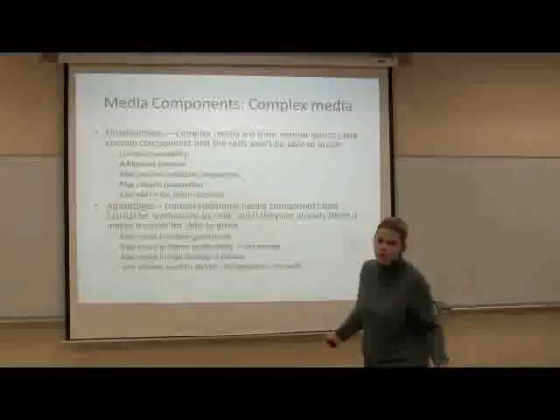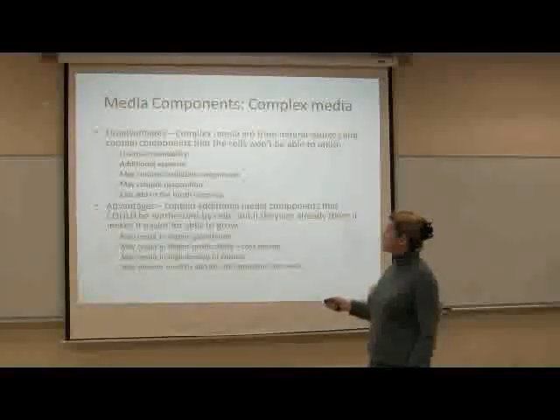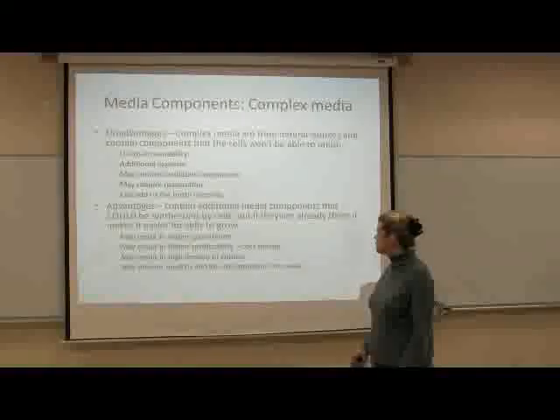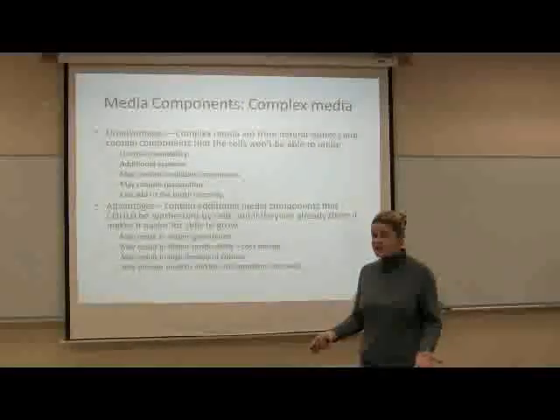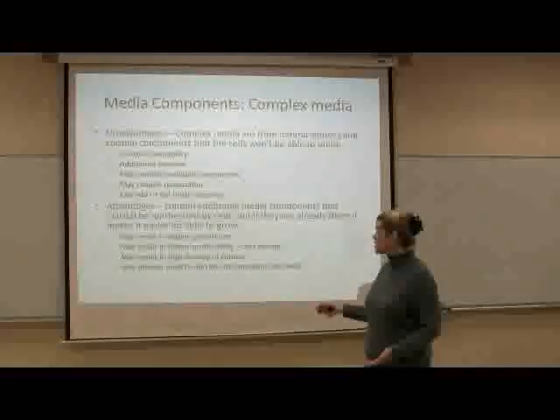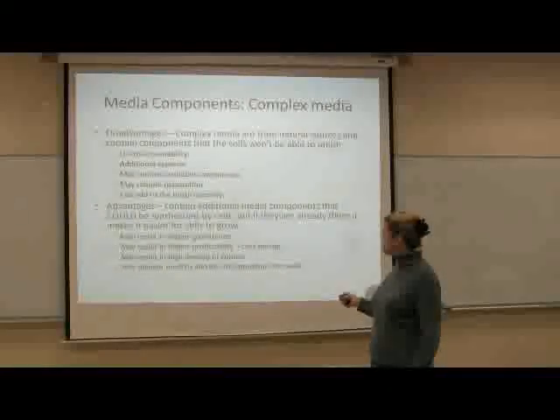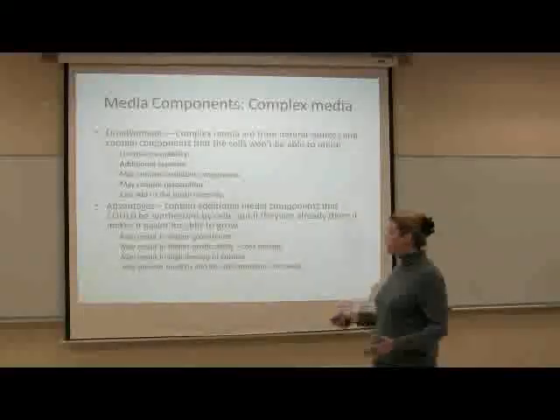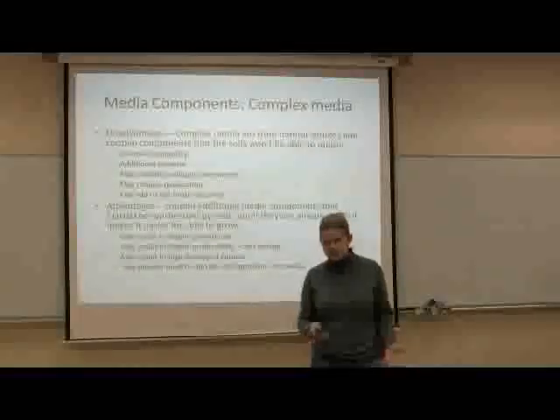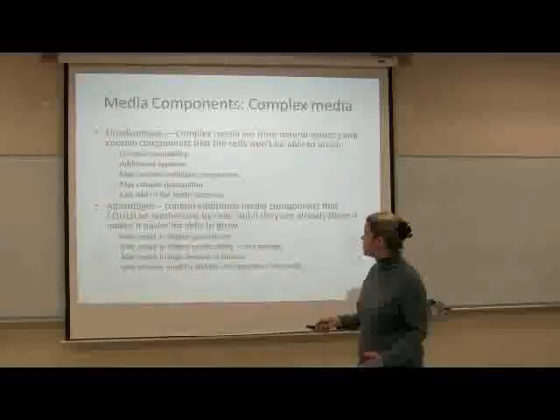You may be better off with complex media. It certainly is easier to use, although sometimes it requires maceration. We don't have to worry about that, but you might need to grind your stuff. Okay, and the advantages of complex media is that it contains some components that would otherwise be synthesized by the cells, and then the cells don't need to synthesize them, so that's really a major advantage. So you might get a higher growth rate, higher productivity, cost savings, higher density of your culture, and less effort to include all these ingredients. So it can really be advantageous to find a cheap source of a good complex media for your process.